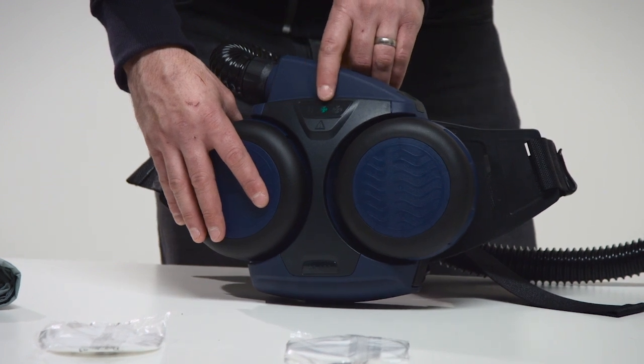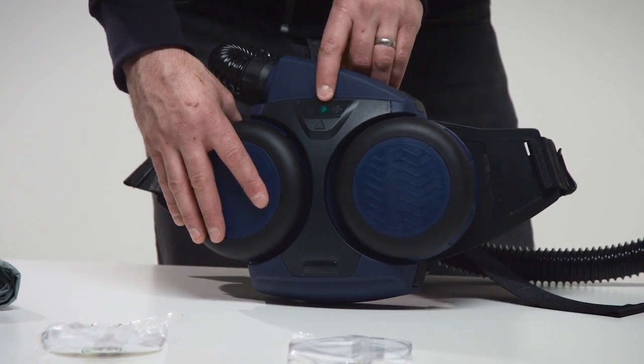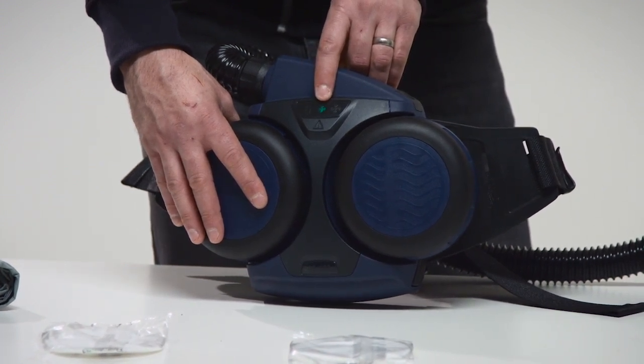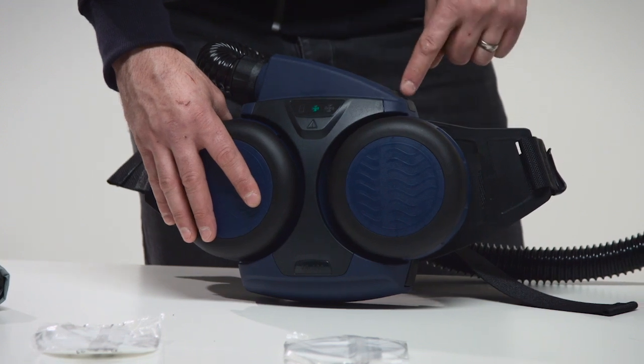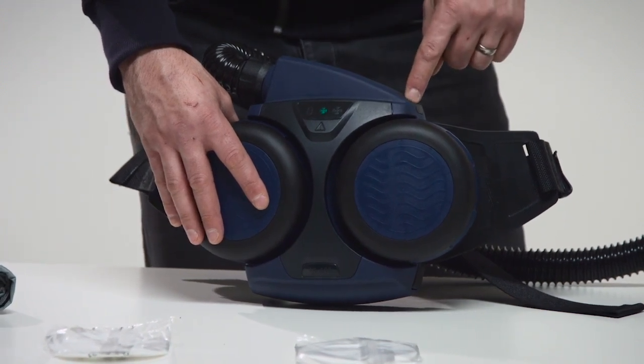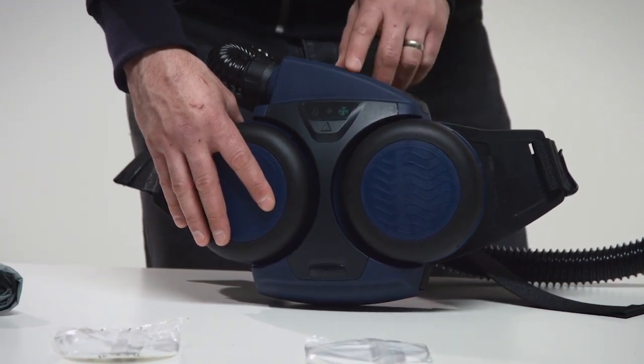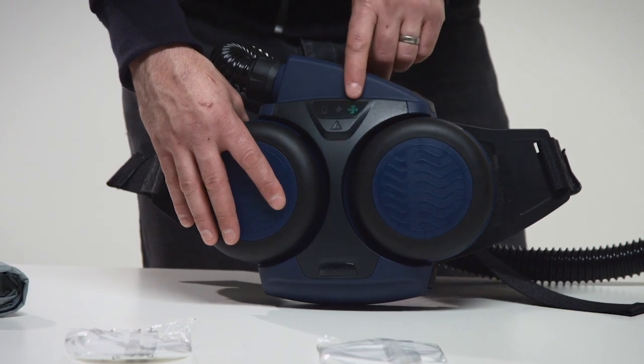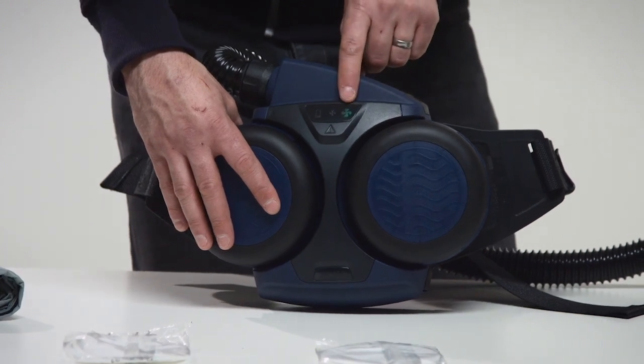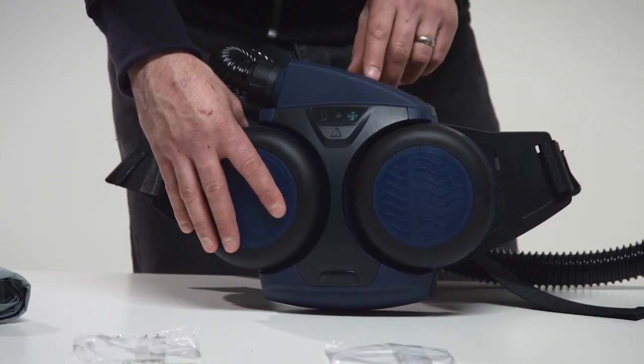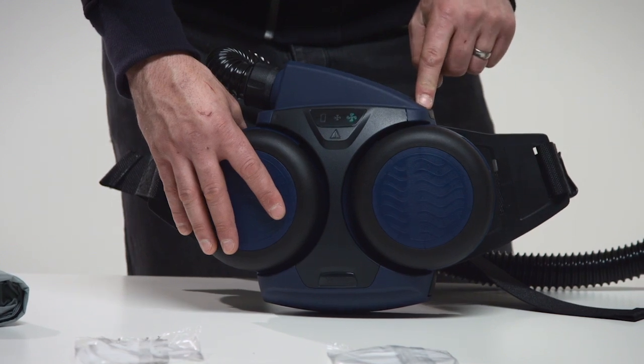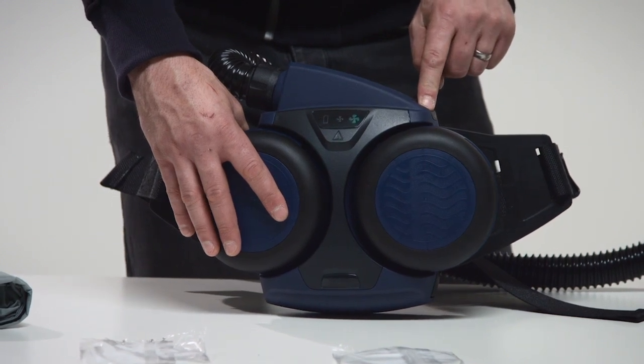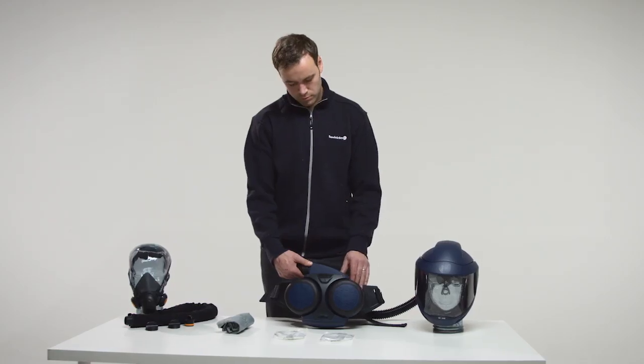The fan unit starts in normal operating status, 175 liters per minute. The switch between normal and boosted operating status, 240 liters per minute, with the control button. To switch off the fan unit, keep the control button depressed for about 2 seconds.